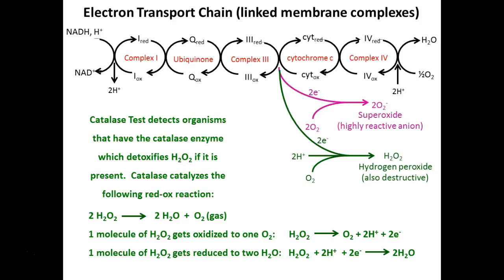That's also why you don't want to swallow it. That reaction would happen inside your body. It would be really bad. It's also why it's kept in a dark bottle, because light can cause that reaction to happen as well. So they're trying to minimize it breaking down into water and gaseous oxygen. Another clue that it's probably been there for a long time is if you open the top and it fizzes like when you open a soda can. That's because the oxygen gas is being released that has been building up while it was closed.